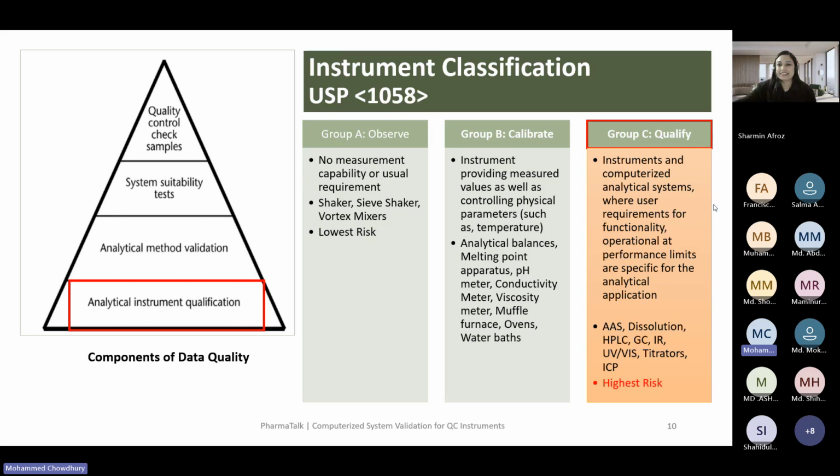Another question: can I install a software before preparing FS or design specification? Before designing, you have to define the specification, roles, and functional access.